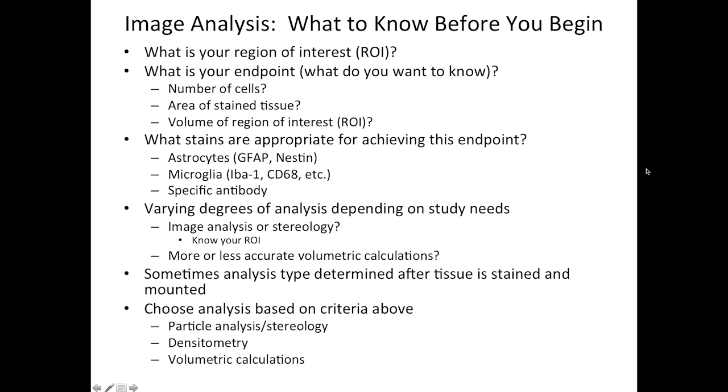And that's where the question of, for example, image analysis or stereology comes in. Stereology is very good at many types of analysis, volumetric calculations, cell quantification. But on the other hand, it's also very time consuming and very expensive.